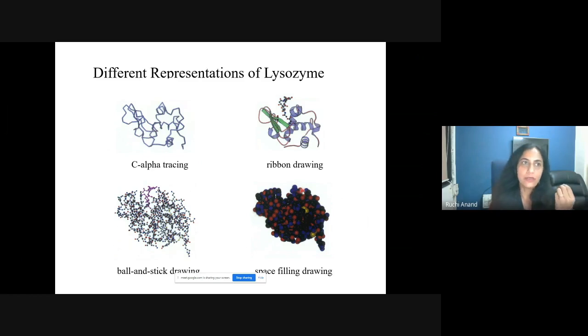So one thing you need to notice, most of the time where a cleft or an opening in a protein happens is where the active site is, where the reaction happens. And here you can see this is your substrate, that sugar substrate that we were talking about. It goes in this cleft where it gets cleaved, and that's how the function of lysozyme happens.